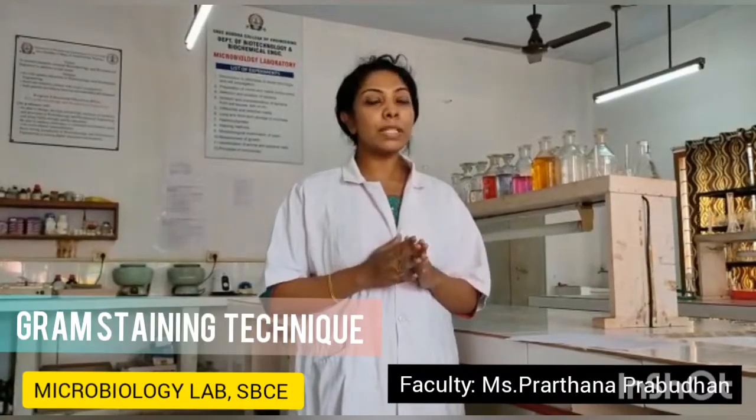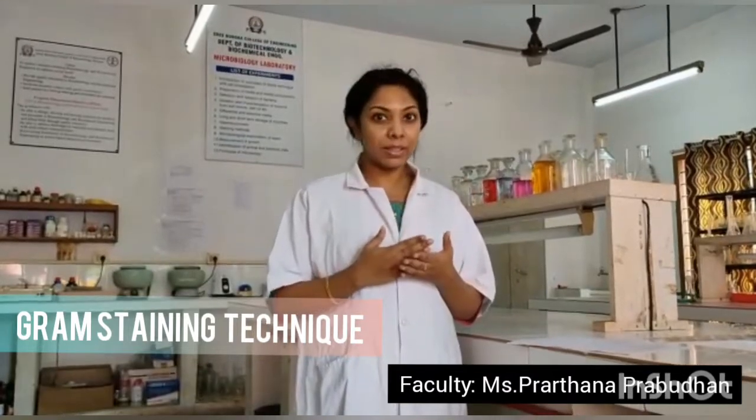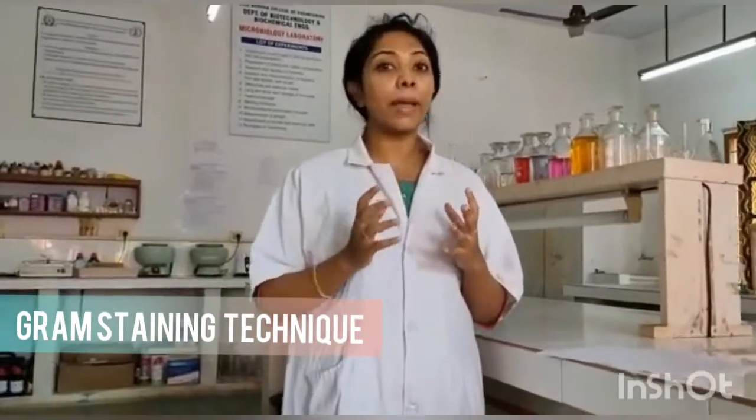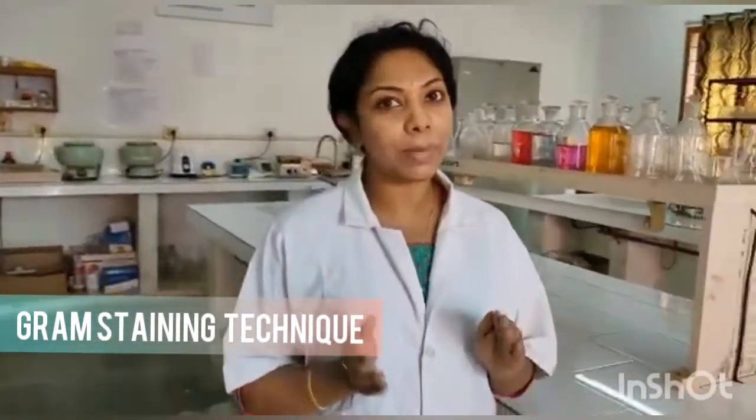So today's experiment is gram staining. Gram staining is also called Gram's method. It's a method of staining which is used to distinguish or classify bacteria into two large groups called gram positive and gram negative.